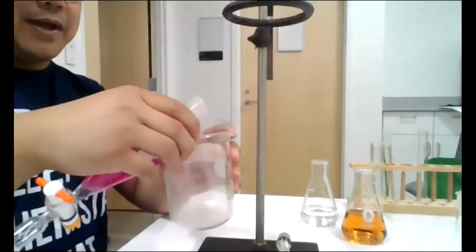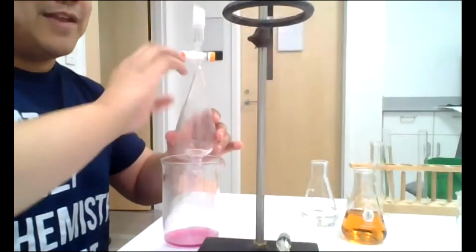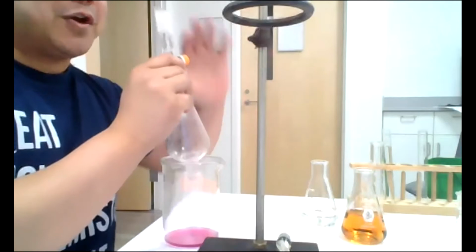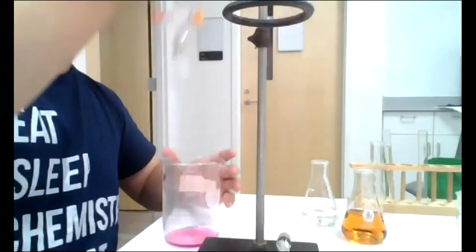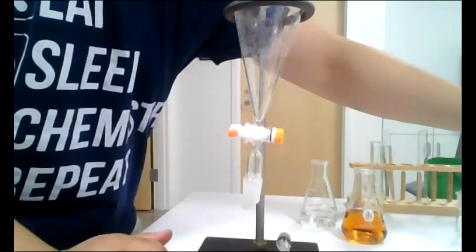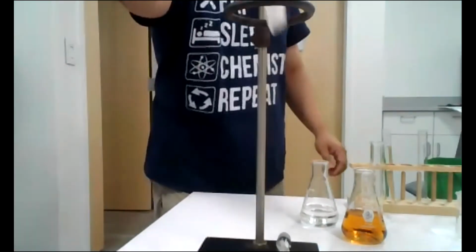So I'm going to put this into the waste. Organic solvents should never go down the sink because they're not mixed with water. So it starts to coat everything in the sewer lines or the pipes because water can't carry it because it's immiscible. Normally you would wash this, but I have a second separatory funnel next door.